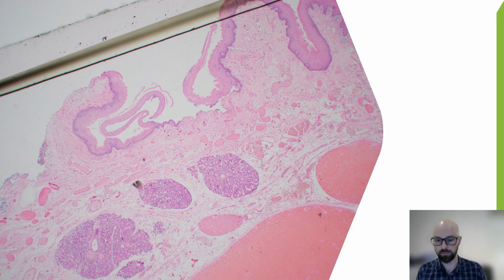Another pitfall when measuring margins is tissue contraction from fixation. So the oral tongue holds its shape fairly well because it has a lot of muscle within it, but the floor of mouth has this really loose stromal connective tissue, and it can really tend to contract up quite a lot. And sometimes you see this kind of concertina effect where the mucosa is all crumpled up from being contracted in.